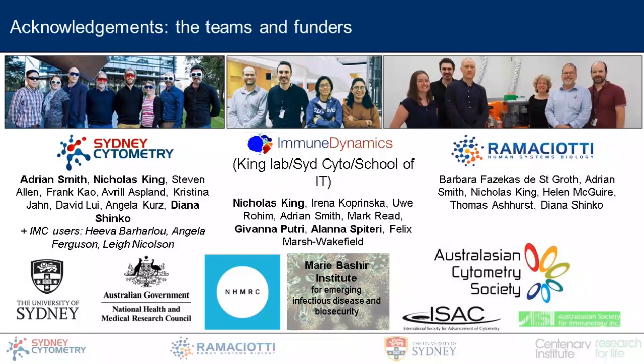But I think what we can start to do is draw on a lot of these machine and deep learning approaches to improve the way we do segmentation, both at the level of quality with which we segment, but I think very fundamentally we need to adapt the way that we actually treat what is now single cell data, knowing that we have these overlapping areas of cells where segmentation isn't perfect, and we need to adapt the way we actually handle that data and analyze it. So I think the segmentation can be improved using a range of the existing tools in machine and deep learning, but I think the way we analyze the data needs to adapt as well.